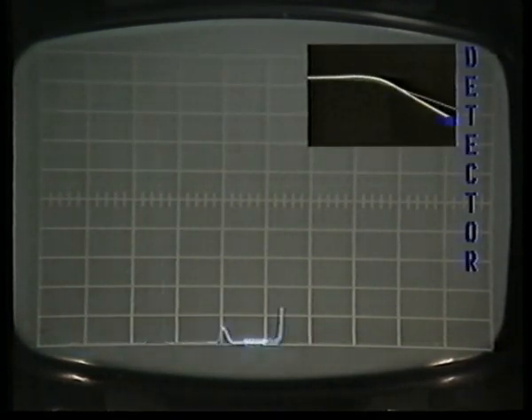In the graphic display, you can clearly see the movement of the ion beams as they are scanned by the changing magnetic field and move across the position of the detector.